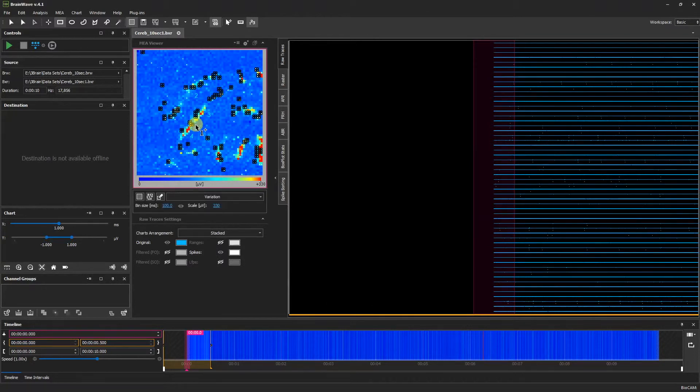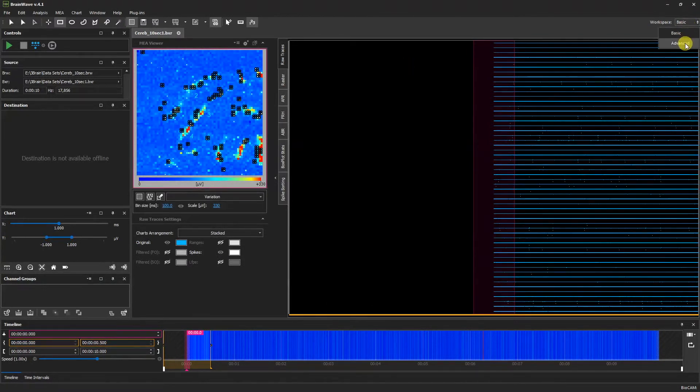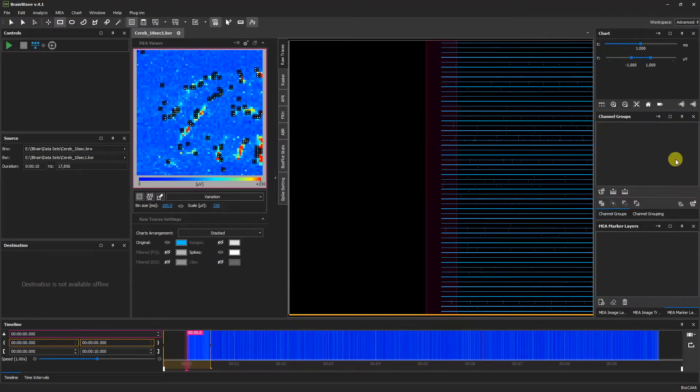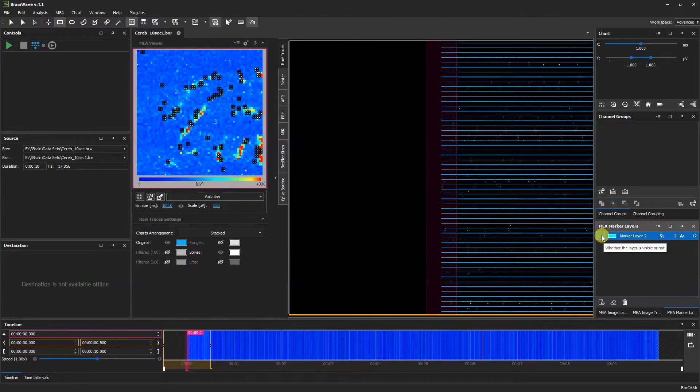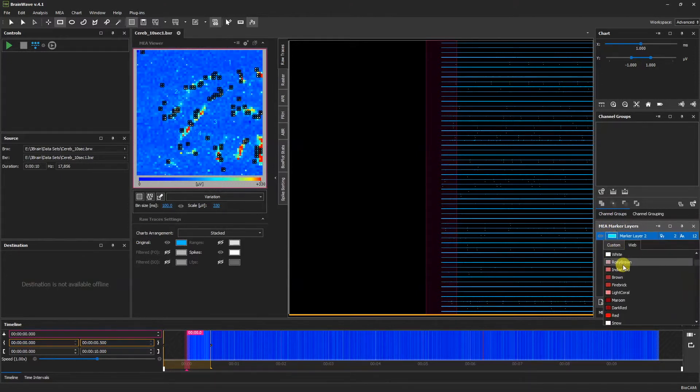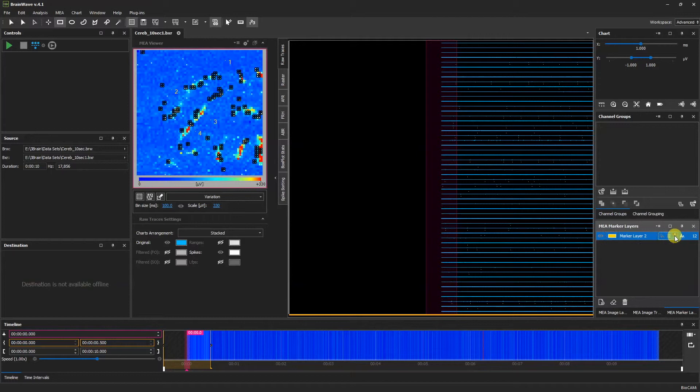If we want to change our counter settings, we can change our workspace from basic to advanced and modify them by going to the MEA marker layers. Here we can add a new layer, toggle the visibility, change the color, the marker size, and the label size.